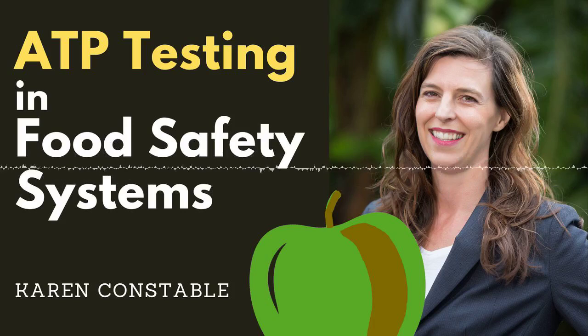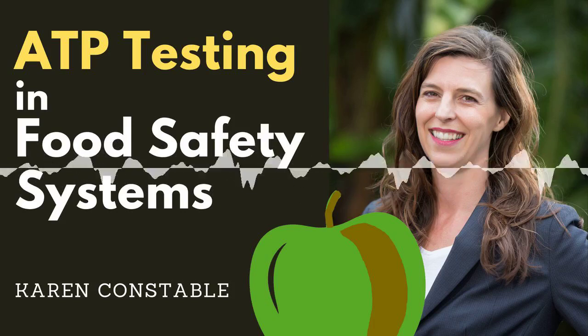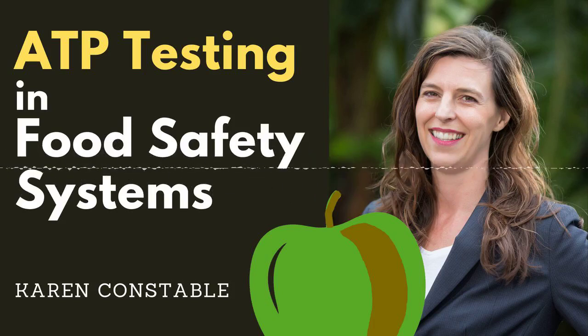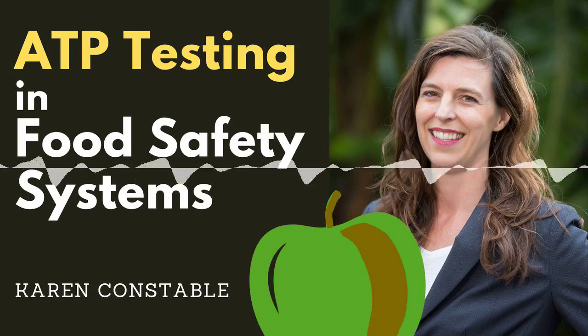Some sanitizers interfere with the ATP bioluminescence reaction. ATP tests can be used for water quality testing, including for recreational waterways, by indicating the presence of biological contamination.